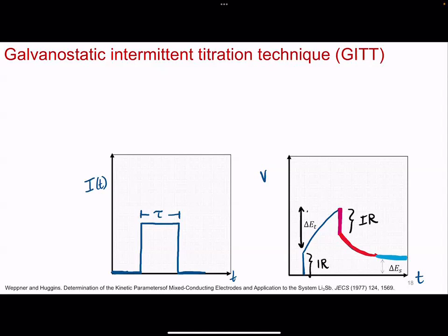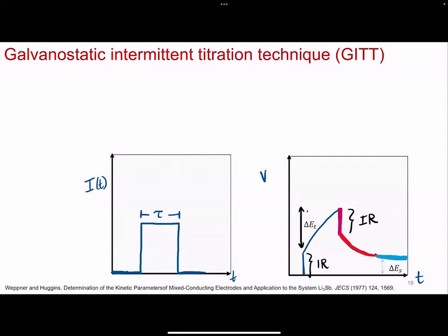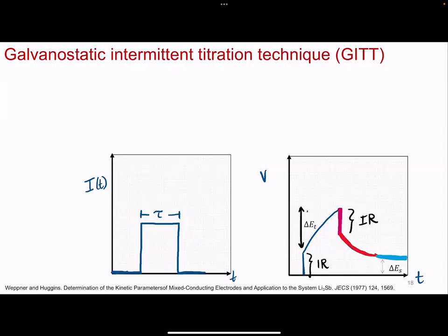If you're at Li1FePO4, or close to full lithiation, or all the way to almost zero, basically FePO4, in those two limiting cases you're in the one phase region. But as soon as you start to lithiate anywhere in the middle, you're going to be in the two phase region. So designing these experiments is not trivial, and interpreting them is not trivial either.